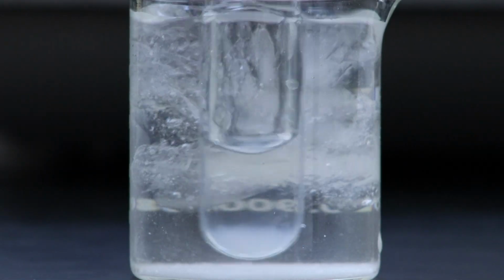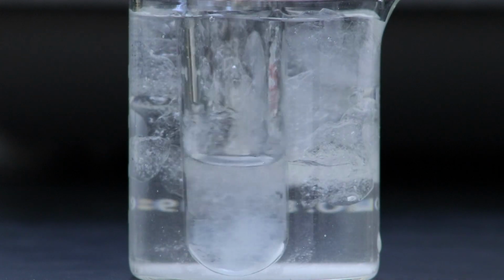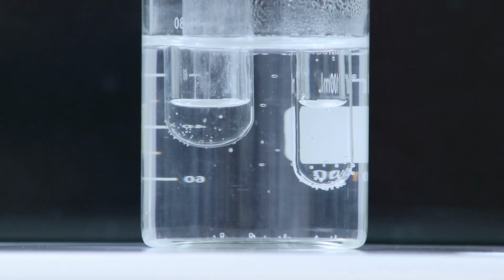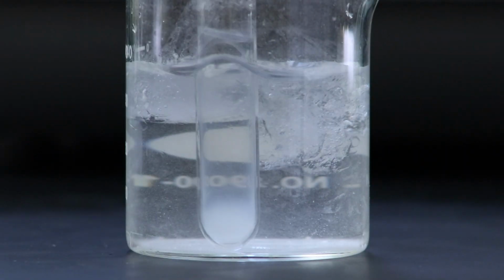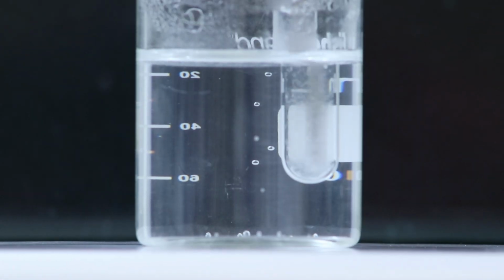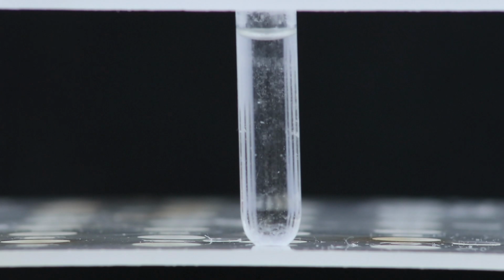I'll check that the product can come out of solution in an ice bath, which is looking like it definitely can. So I'll transfer it back to the Craig tube in a hot water bath so that we can continue the recrystallization process. And the product can still come out of solution in the Craig tube, so I'll redissolve it in a hot water bath and this time leave it at room temperature so the product can recrystallize slowly.